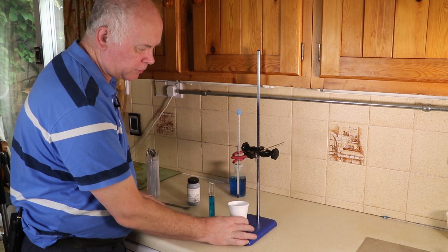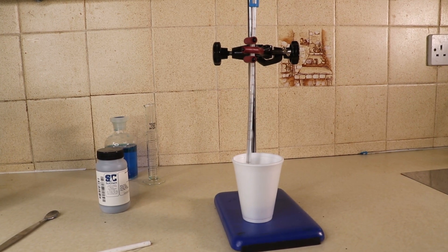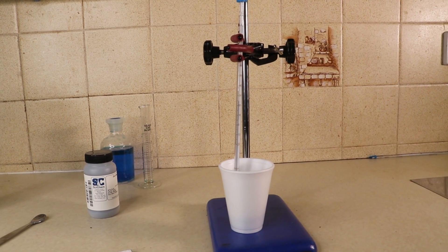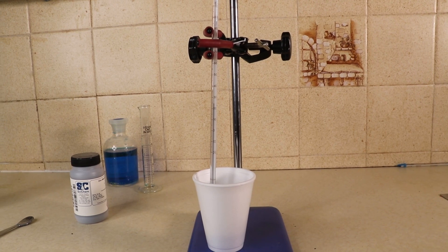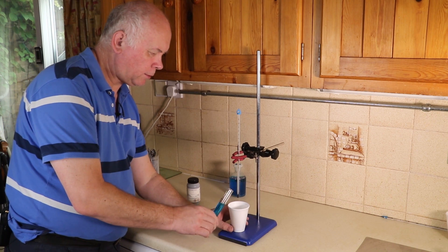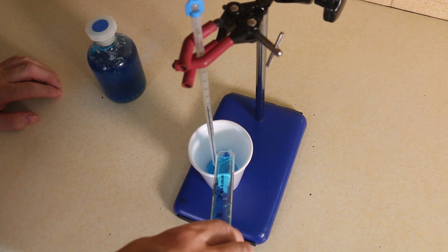We're going to use a polystyrene cup because that's going to keep the heat in. I've got a thermometer which goes up to 100 because I'm expecting a large temperature change. Let's put in the copper sulfate.